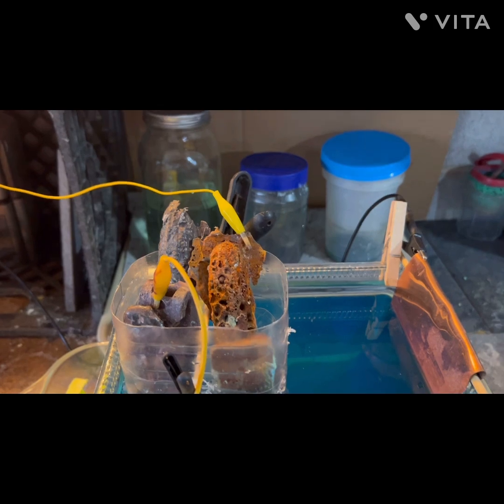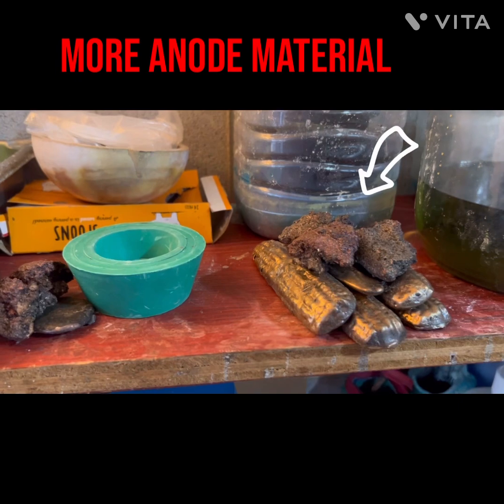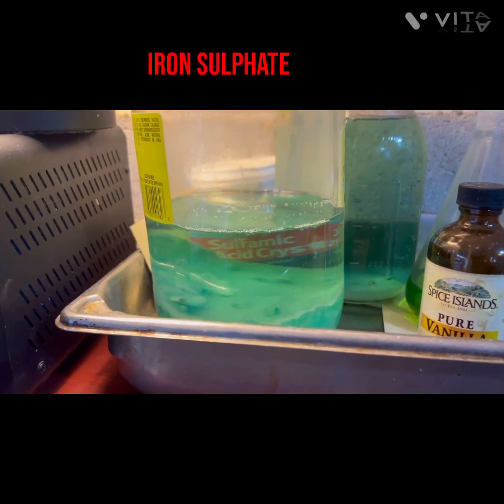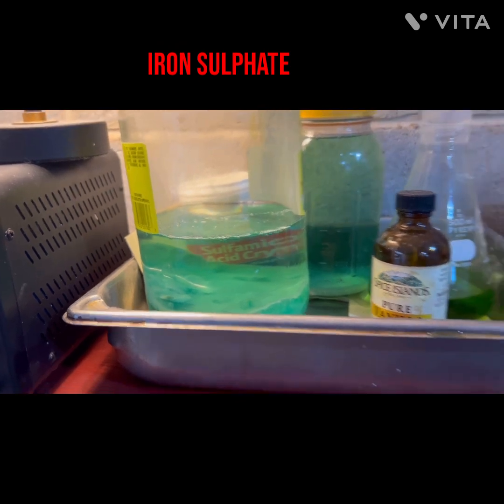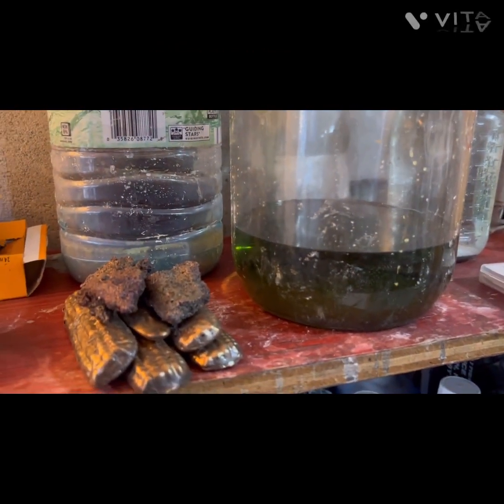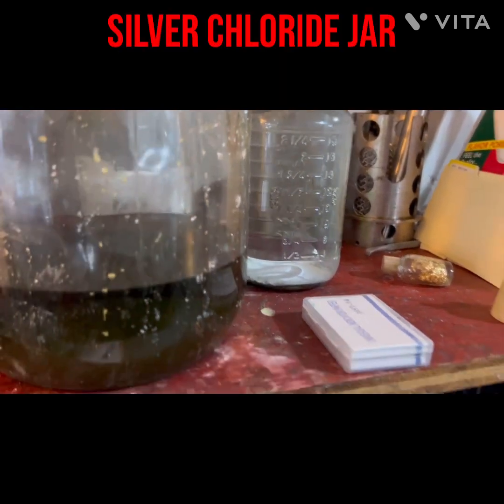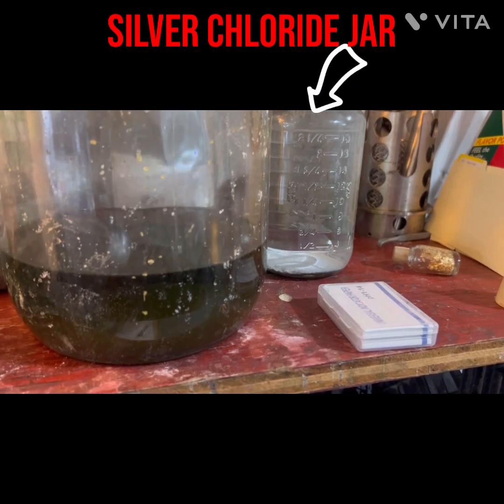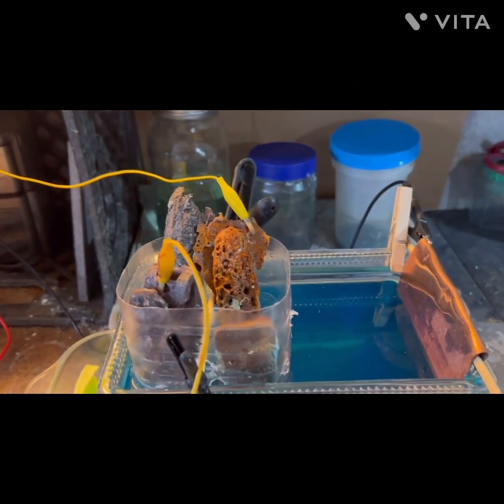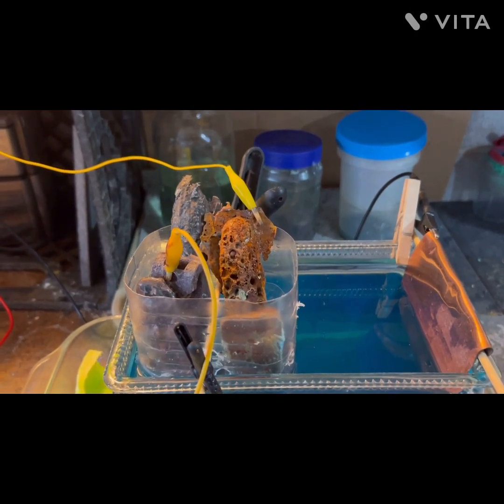There's a little sneak peek of the iron sulfate that just keeps on going. There's my gold recovery jar and some silver chloride — that stuff's looking pathetic. And of course the pH papers that I can never find when I need them. It needs a little clean up, but we're ramping up — that's my copper sulfate cell in a nutshell.